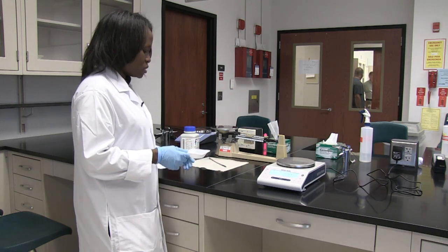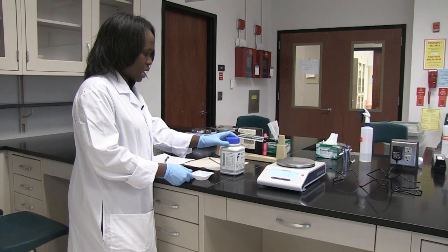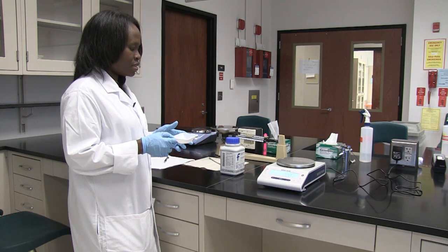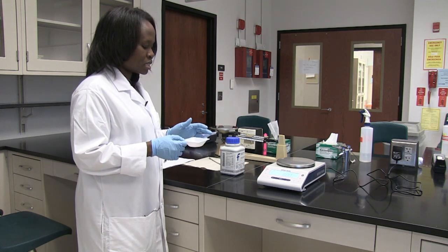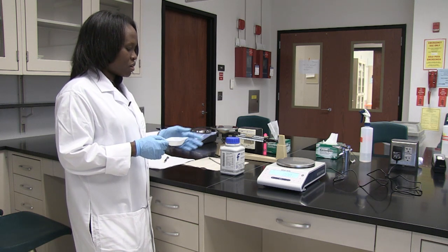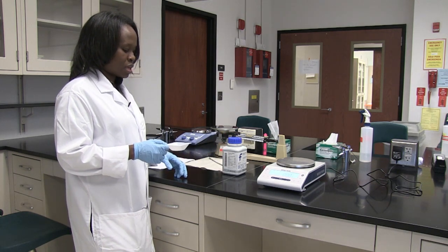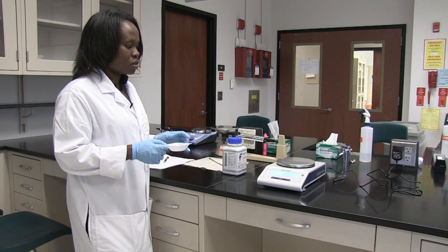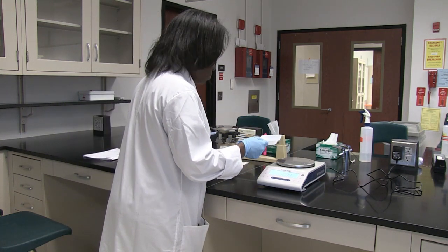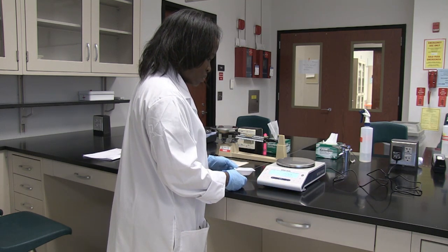In order to measure the mass of the solid, I have to measure the mass of the container that the solid is going to be in first. Then I'm going to measure the mass of the solid plus the weigh boat. And then get the weight of my salt by subtracting the weight of the salt plus boat minus the weight of the weigh boat itself. So before I put my weigh boat on, I'm going to make sure I tare or zero the balance.